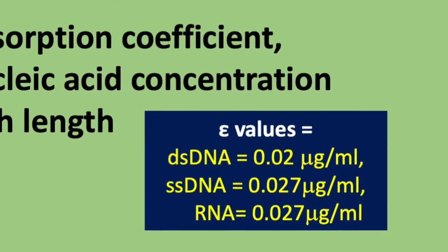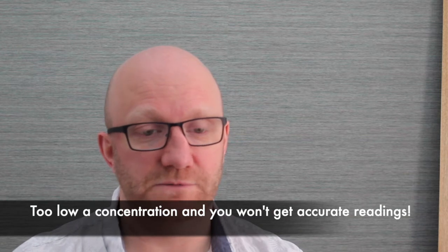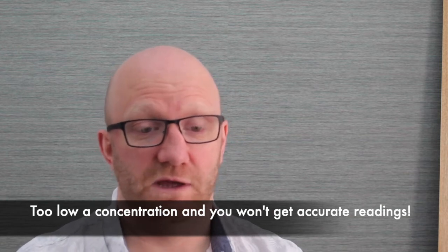The accuracy of your absorbance measurement obviously makes a big difference here. For most spec machines, there'll be a range over which the measurements are reliable, so the linear range of the assay. A problem you will run into is that if your RNA is too low concentration, then the measurement won't be accurate, in which case you have effectively just generated a random number, not really very useful. At that point, you probably should consider using a different measurement technique, though possibly if your concentration is that low, it may not be useful anyway.